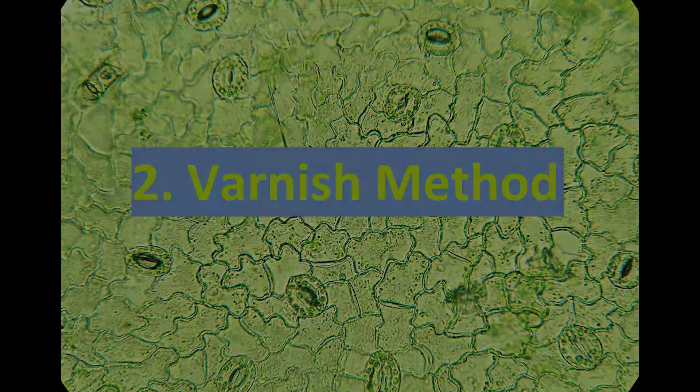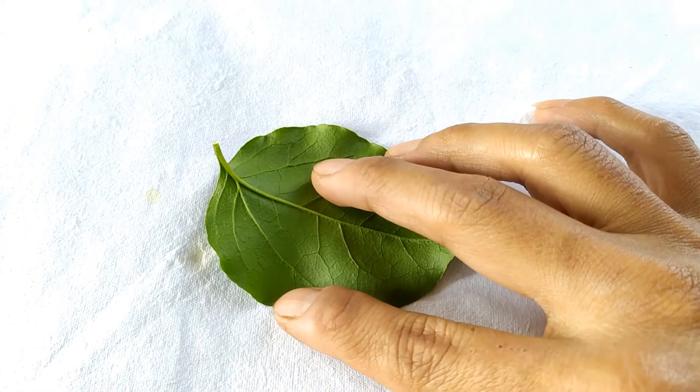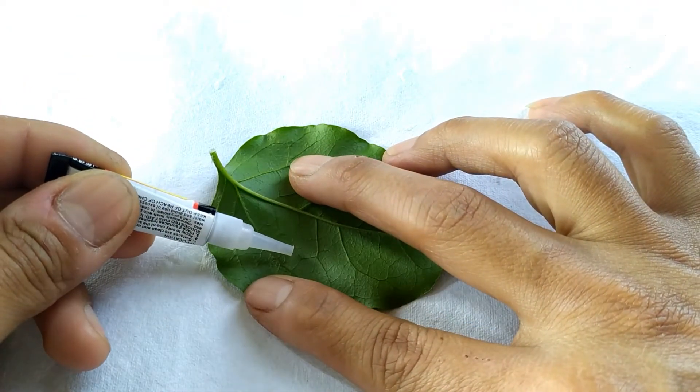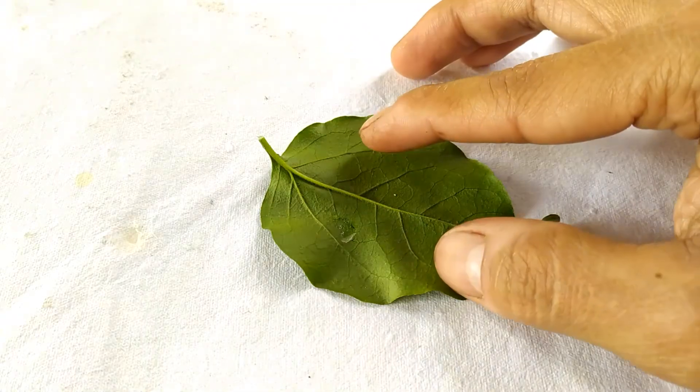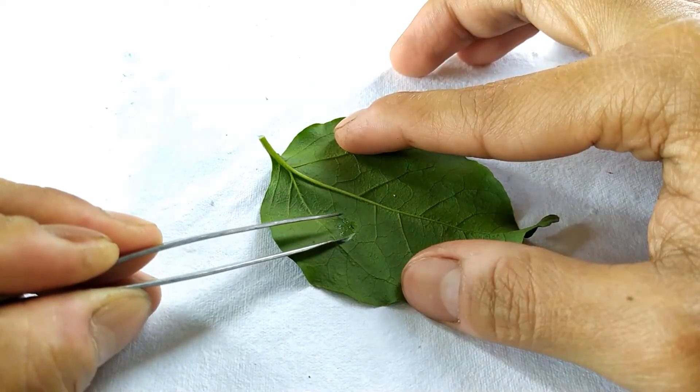Cover the leaf peel with a cover slip and observe under the microscope. For the varnish method, take a fresh leaf and apply a small amount of superglue or nail varnish on the lower surface of the leaf. Once the glue has sufficiently dried, gently pull it off the leaf using a tweezer.